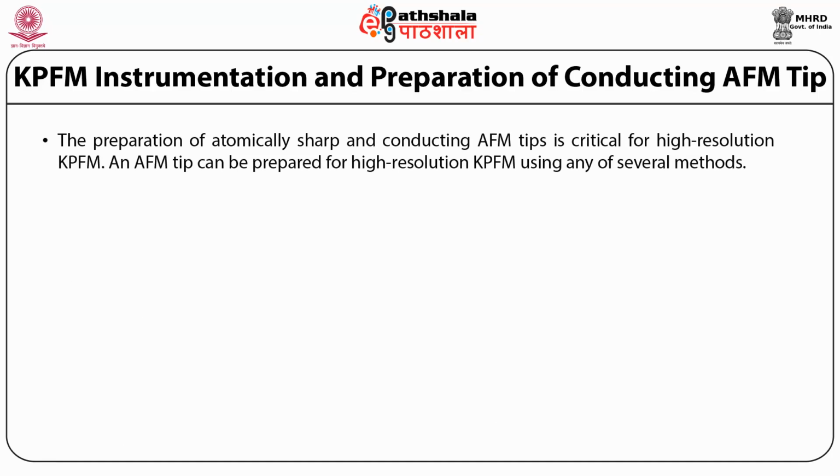The preparation of an atomically sharp and conducting AFM tip is critical for high resolution KPFM equipment. An AFM tip can be prepared for high resolution KPFM measurements using any of several methods.